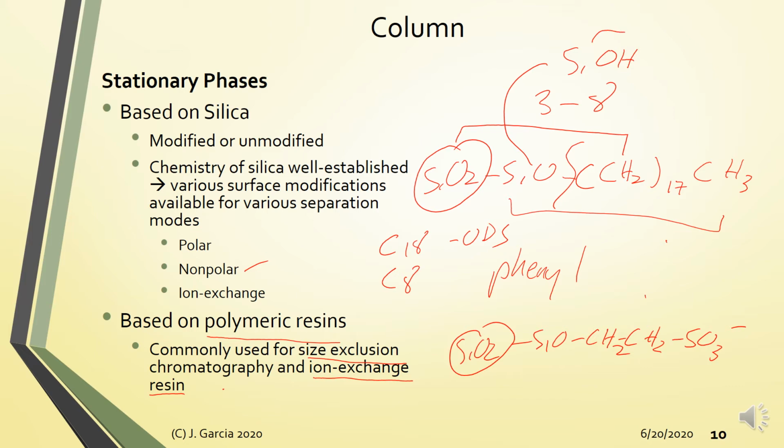Because this kind of cleavage, and you get these unwanted silanol groups, will lead to tailing. Alright? Because this group is actually very polar. Alright? So this will lead to tailing. So over time, okay, we all know that the column is consumable in HPLC. So over time, for non-polar silica stationary phases, talagang nagde-degrade sila, no?